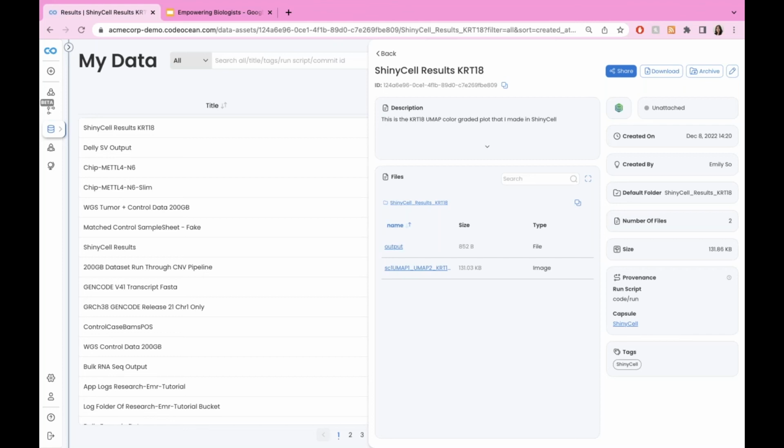to collect results. And there are a bunch of options on which ways she can work with this image, but it's a great way to maybe batch share or individually share previous results of images that you got without having to scroll through that timeline, depending on how busy it gets, and find the exact image and having them download it to their local computer. Data sets are a really easy way to organize those types of results that you get and share them basically.